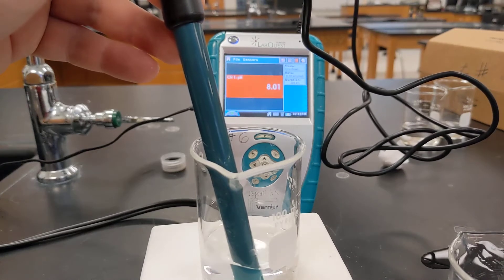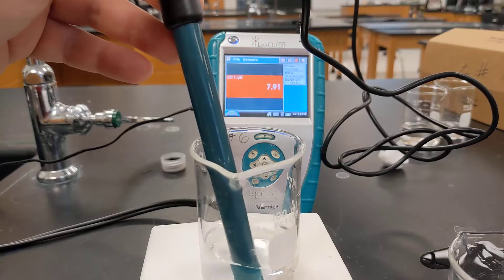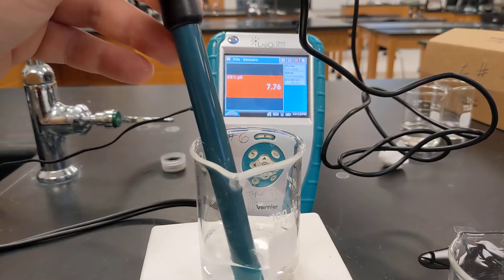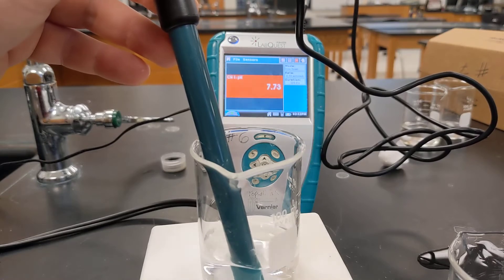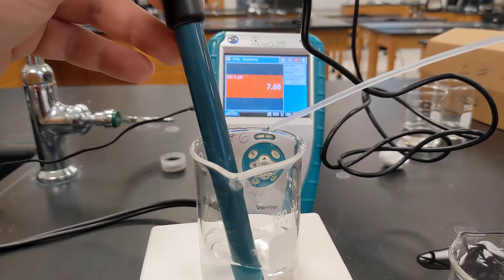For this demonstration, I'm going to show you the effects of adding a strong acid or base on a non-buffered and buffered solution. So first I have right here some distilled water and you can see what the pH is, and I'm going to add a single drop of hydrochloric acid.